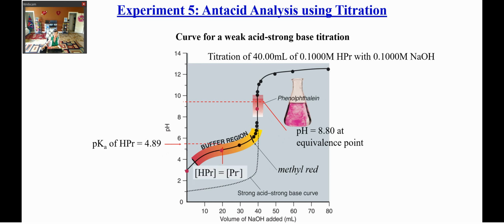For example, you titrate a weak acid, and initially your acid has a pH smaller than 7. So you will see a region we call the buffer region. This buffer region means you are going to form a buffer solution, meaning at this point the pH changes very, very slowly. So you are going to use different indicators, depending on your system.